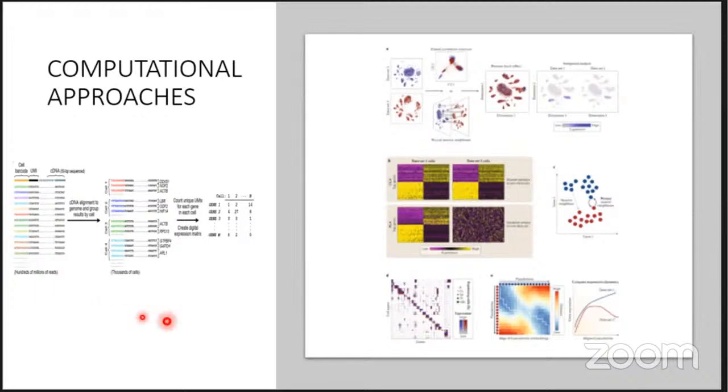So the analysis itself is very crucial, because we have to do normalization and dimensionality reduction to reduce the data and make it more crisp. And then if you look here, you can see clearly the cell clusters. These are the clusters from one sample.